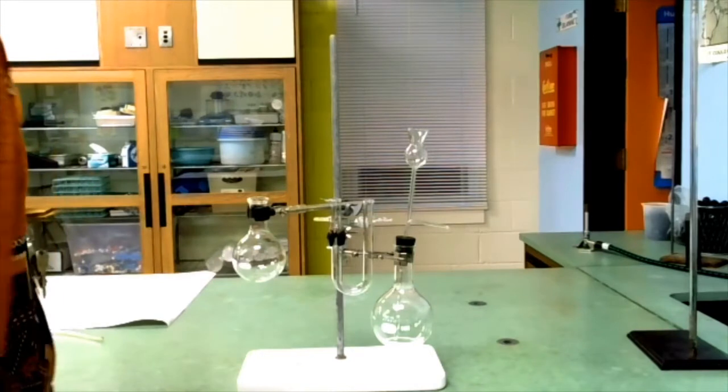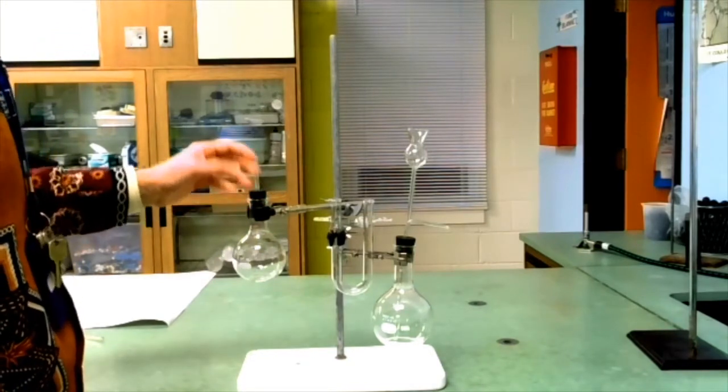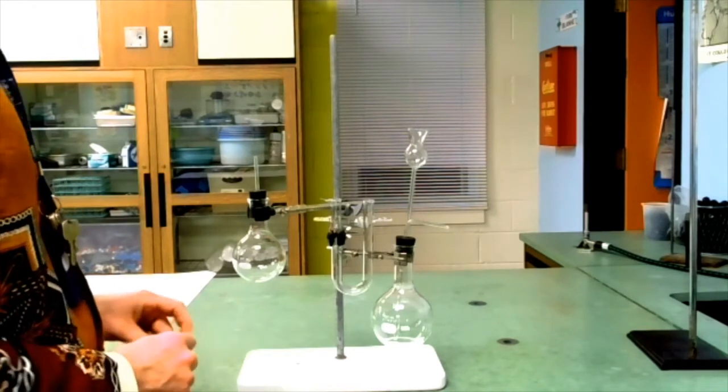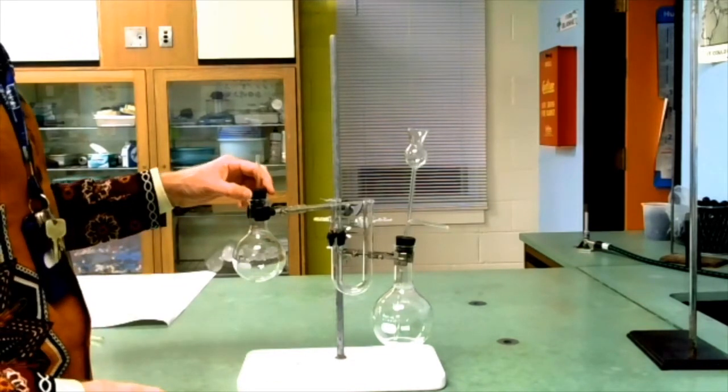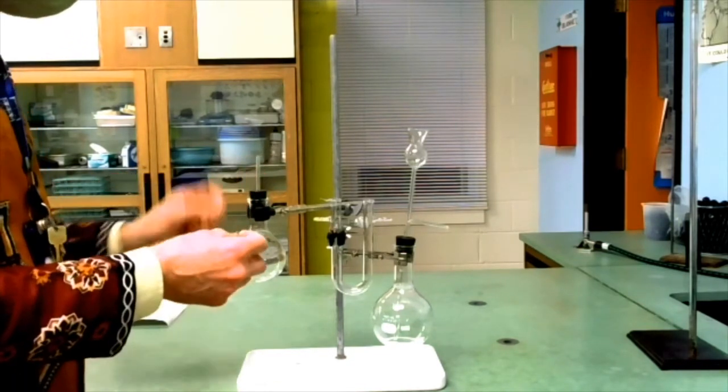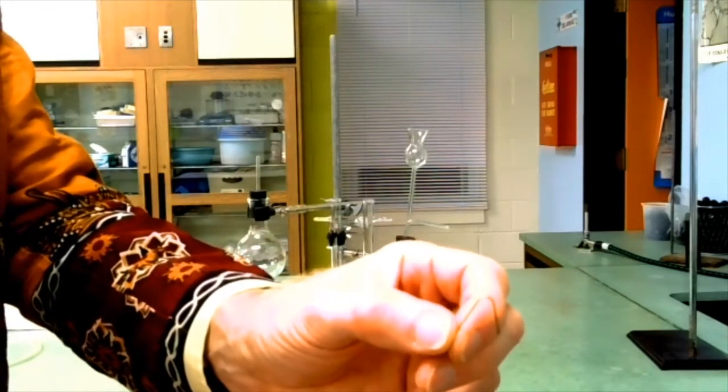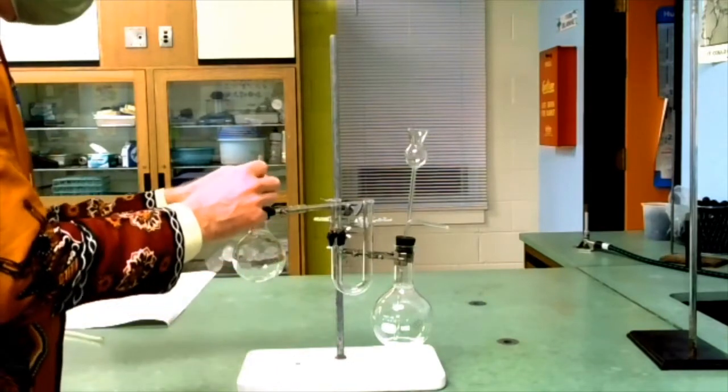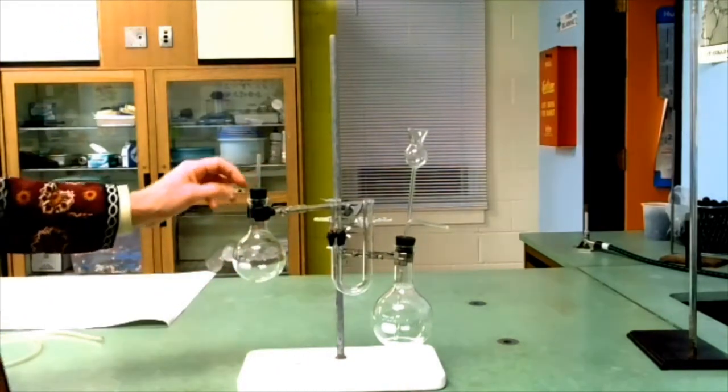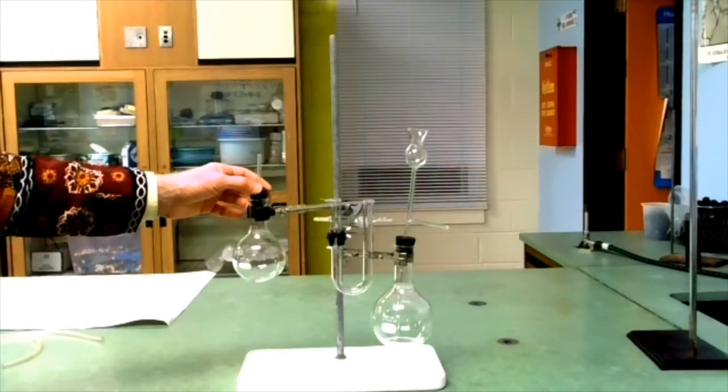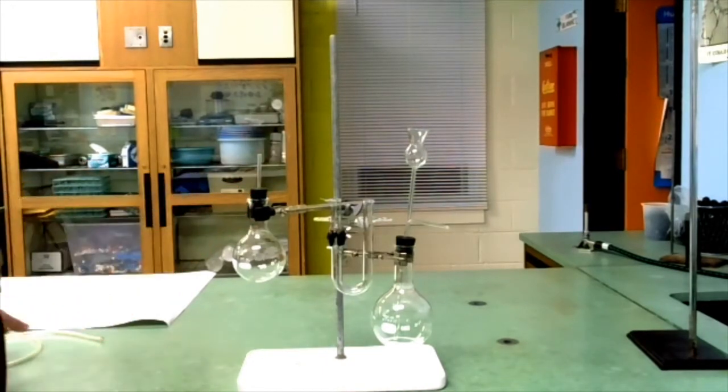The receiving flask has its own stopper. And as we'll learn, this stopper in the receiving flask should never be tight. It should be ajar. For that, I will use a piece of wire just to make sure that there is always a gap between the stopper and the flask opening itself.